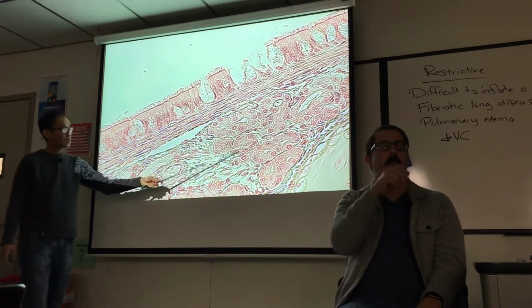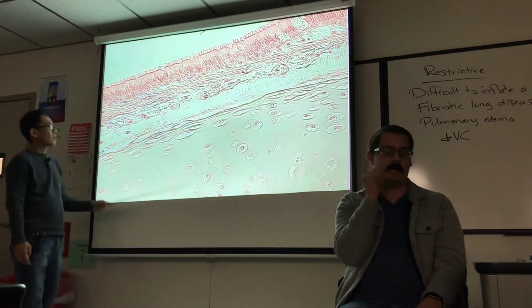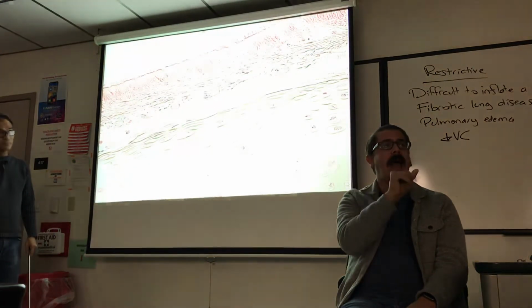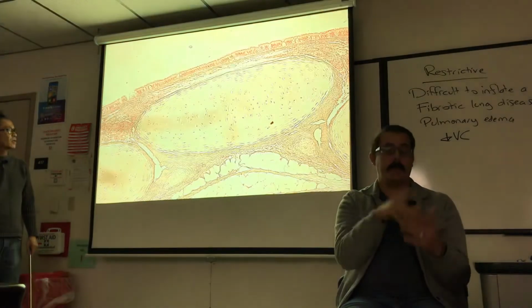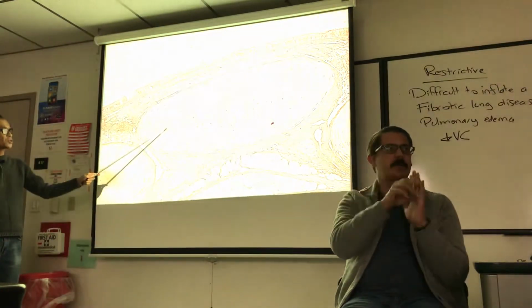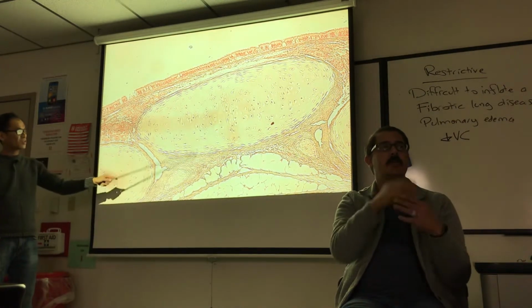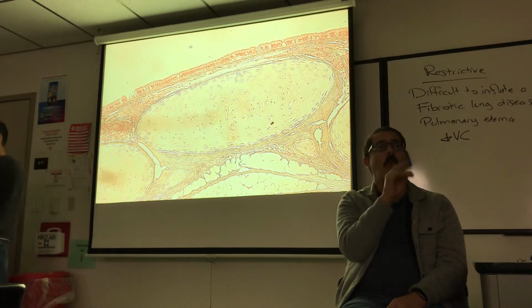These are seromucous glands of the submucosa. And here is the hyaline cartilage of the adventitia. Okay. So once again, I think this is a better picture of the hyaline cartilage. The adventitia contains all of these tissues too, but I usually don't ask that. Just tracheal ring is the important structure I'd like you to be able to identify.